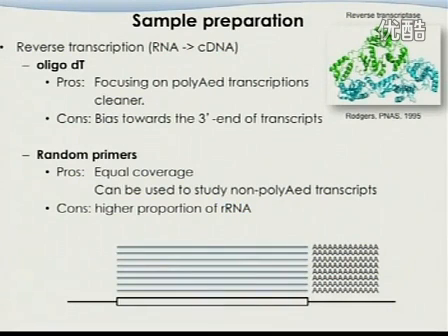Okay? And the limitation of random primer is sometimes it doesn't get rid of the ribosomal RNA as well as the oligo-dT approach, because ribosomal RNAs are not polyadenylated. Okay? So there's a balance here, and our experience is now it's mature enough just to trust the ribosome depletion and go towards the random primer part.